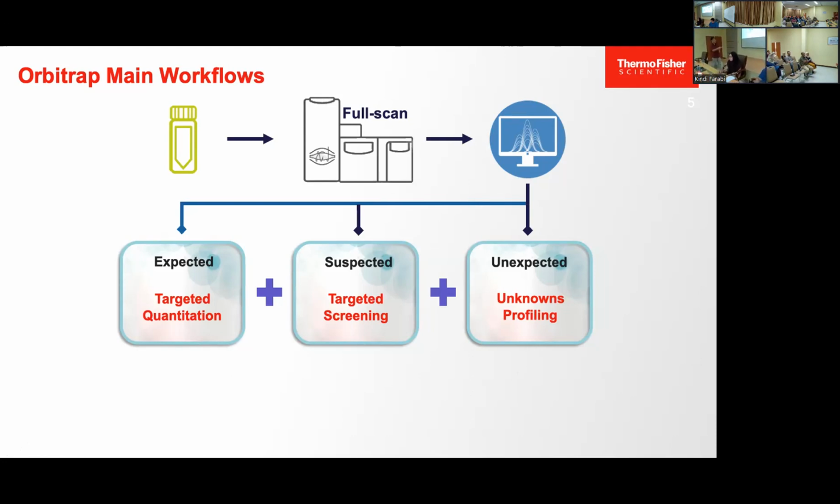The next one is actually unknown, untargeted. Okay. So about 10 years ago, when the melamine cases broke out, because everyone was doing targeted quantitation, we only looked at what we expected. When the outbreak happened, it moved the entire analytical world to targeted screening.